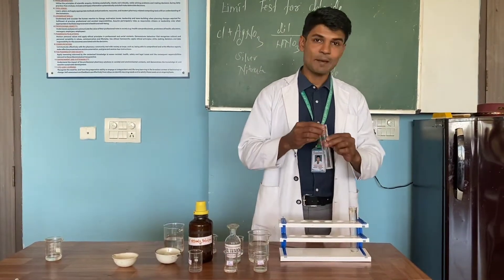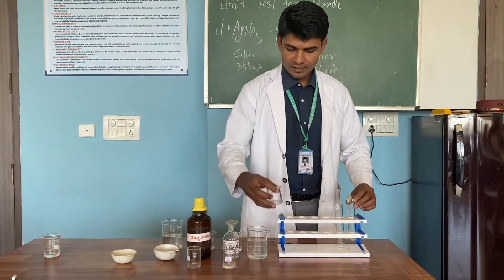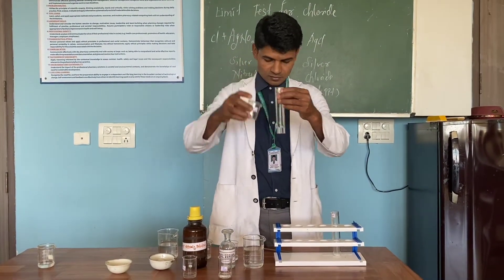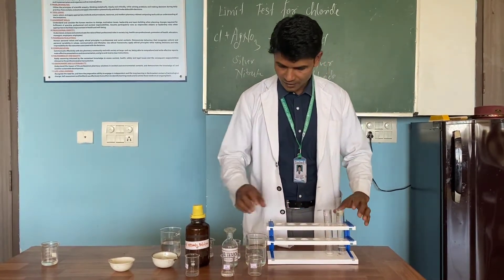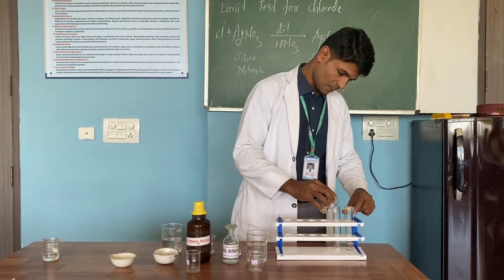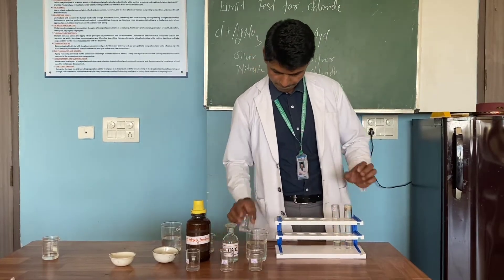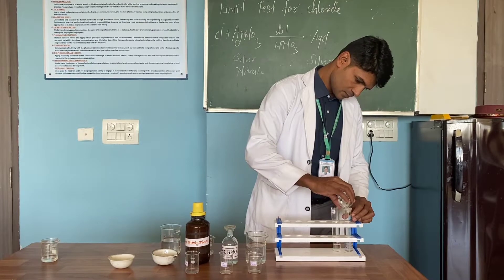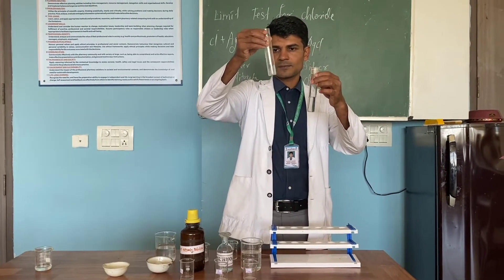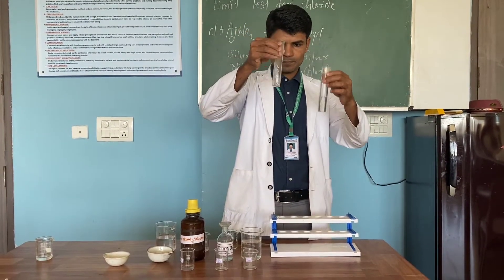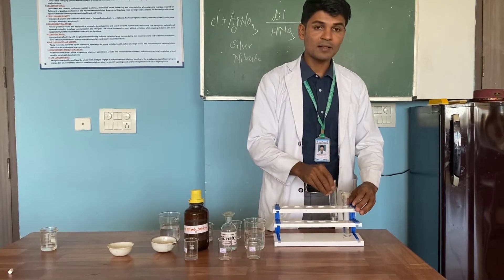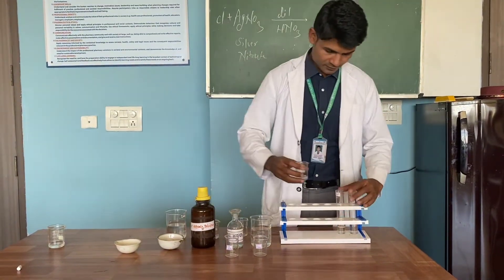I have taken the sample here — a small quantity of sample you have to take. I have measured quantities already. This is the standard solution. After that, take 10 ml of dilute HNO3 in both Nessler cylinders. Shake the solution so that the sample gets dissolved. Then add 2 ml of AgNO3 solution in both the Nessler cylinders.